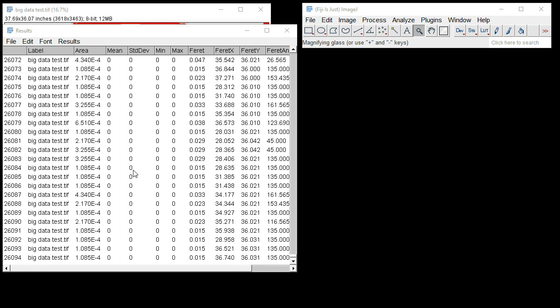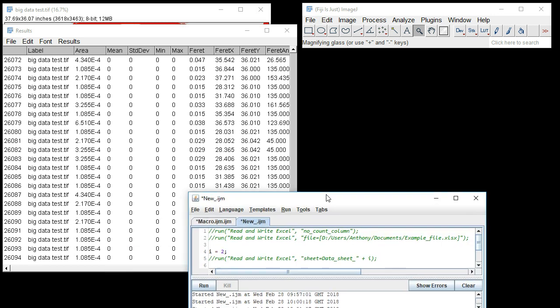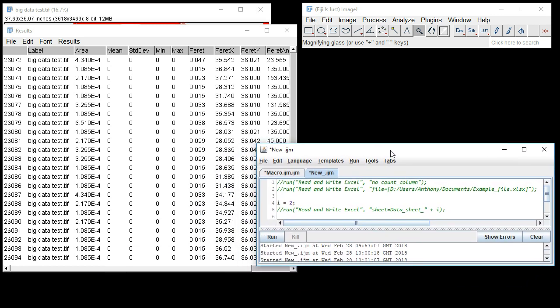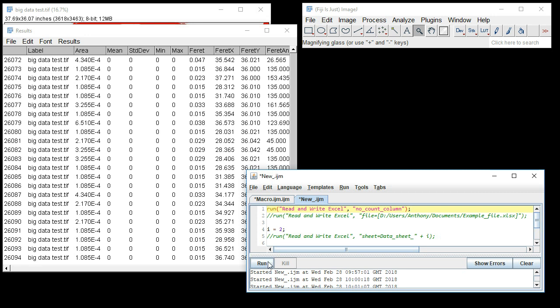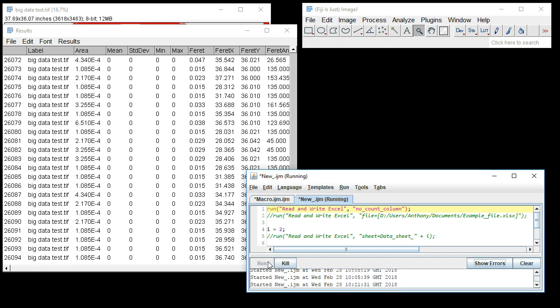I'll close this now and show you some of the extra features of this version. Using regular macro language, we can call the plugin by run("Read and Write Excel") and introduce an argument. Here we can have a "no count column" argument which will omit the counts column. If we run this, you can see that the export is tracked with the progress bar.